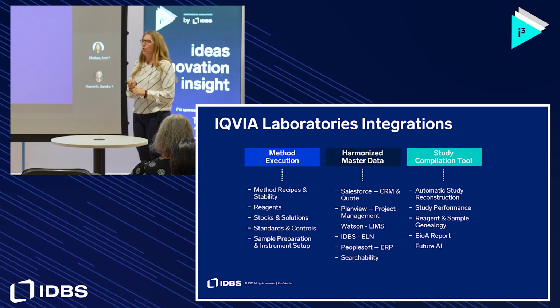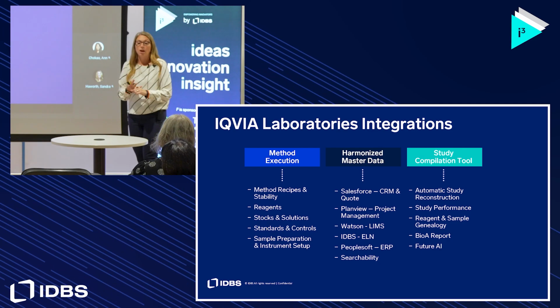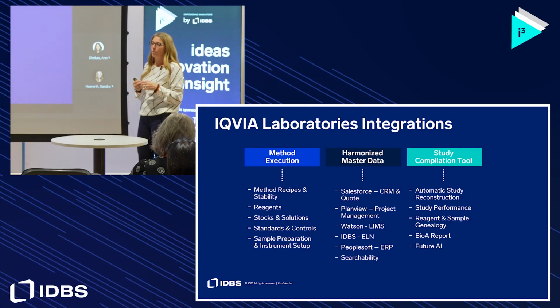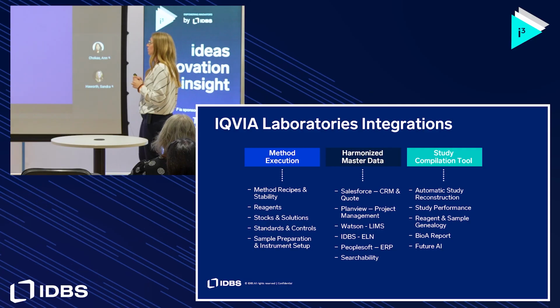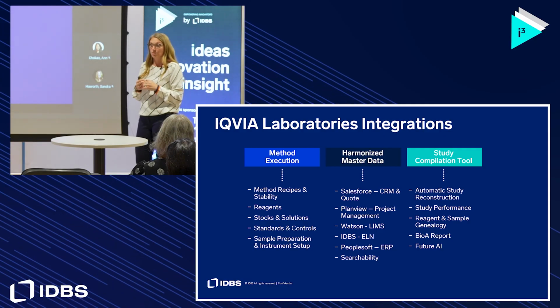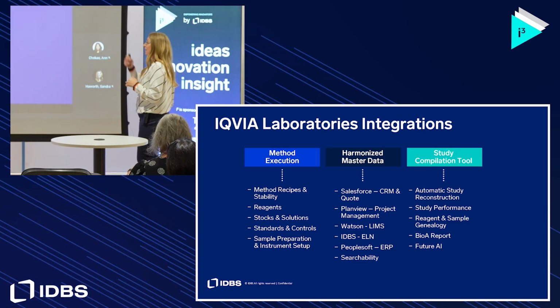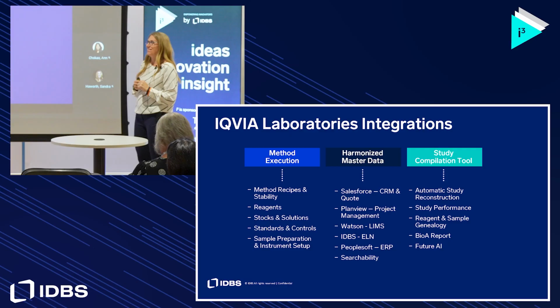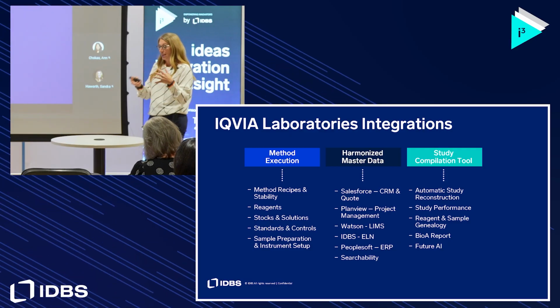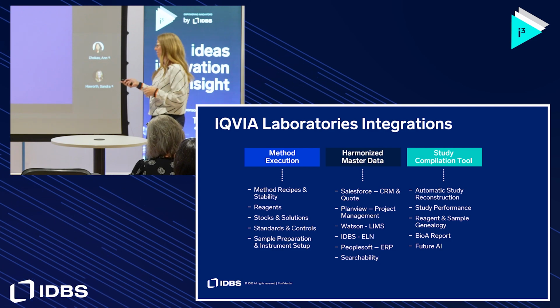So it's like every lot number of reference material that our client would send us, or every lot of matrix used on the run, every piece of equipment used. All these things are just a requirement that the FDA requires us to put in our BioA report. So we're trying to build tools that multiple teams can also use to help them understand what's going on with the study. And that's something hopefully we'll get the version 1 out this year. Yeah, so then hopefully we can export that and send it to some AI tool so we can learn more about our data.